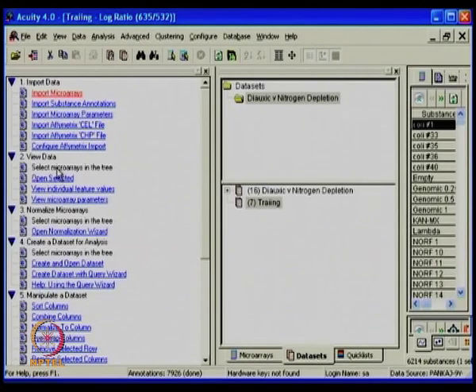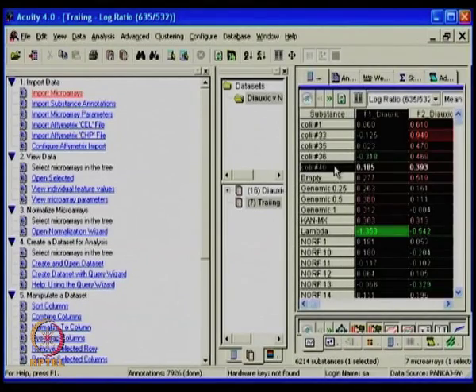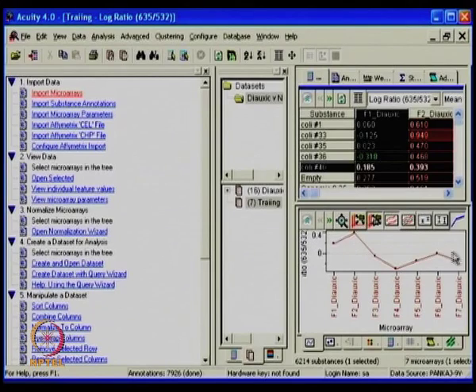And then you have viewing data. As we have seen, you can auto fit the data, you can look at the color coding, and you can view the data in a different form. You can individually look at them, or look with the numbers and compare them and see all the arrays and how the behavior is happening. You can also look at the profiling at the bottom based on what you have seen earlier. You can click on the profile, and you will be able to see how this has behaved across. So apart from that, the next step involves the normalization wizard.